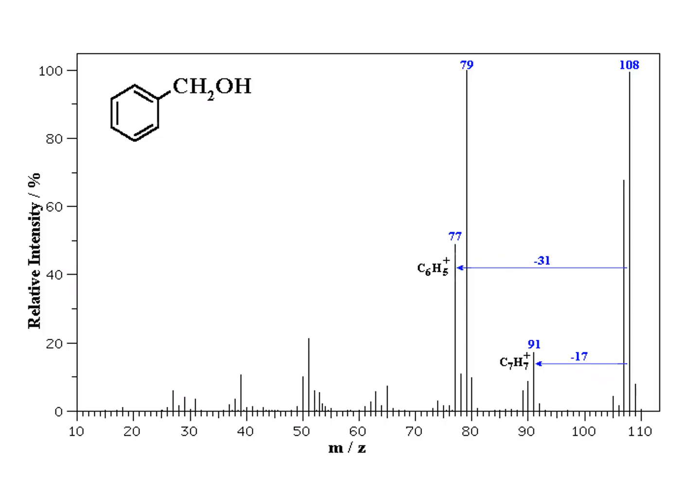We will also have a C7H7 fragment that would have been formed through the loss of the OH. Remember we said that when our alcohols fragment, it usually will form a fragment that is less 17, which is that OH. So that C7H7 is going to be the result of that OH being lost from our structure.